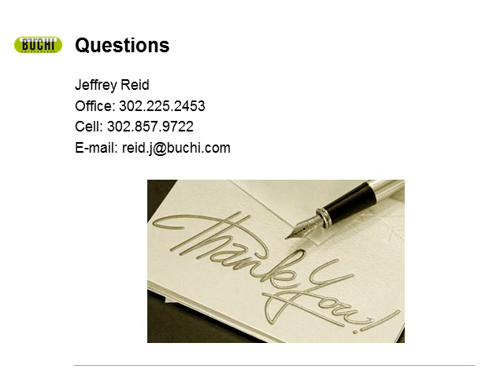So it could vary depending on what you end up getting. If you need to get the complete Syncore, a vacuum pump, and a vacuum controller, I would say maybe $25,000, but I'm not 100% sure. Plus, there's always deals going on, so you could always contact a sales representative.